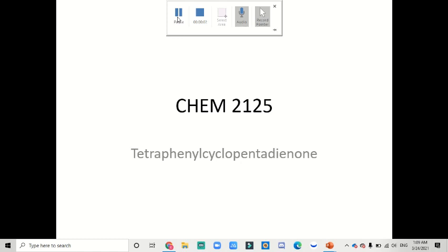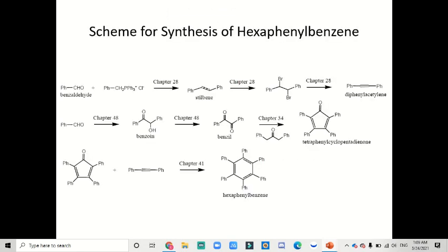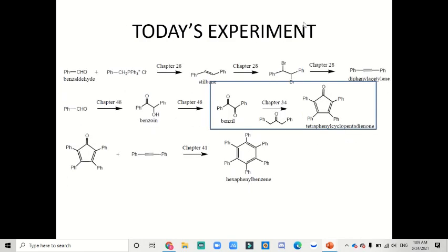Good morning. Today we are going to be working with the synthesis of tetraphenylcyclopentadienone, which corresponds to chapter 3 of your book. In this case, we are going to use the previously synthesized benzil and dibenzyl ketone.